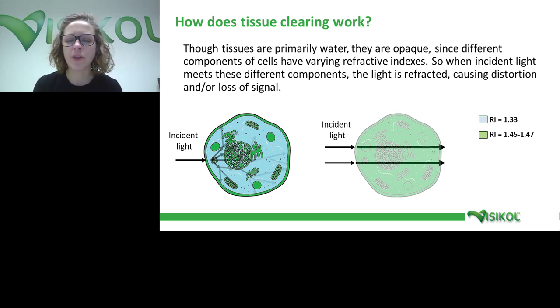So by allowing for that more complete characterization, you can think of things like, if there's some sort of heterogeneous distribution of how cells are responding to a therapeutic, now you're able to much more effectively characterize that rather than only characterizing the cells on the exterior surface.